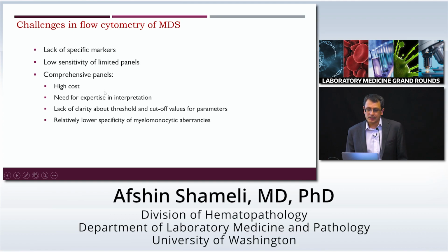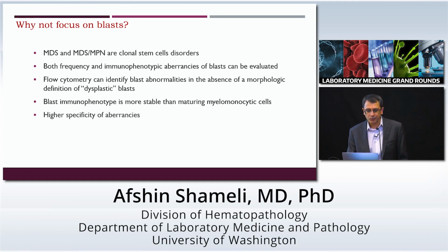Another caveat is that some of the aberrancies on myelomonocytic cells, such as expression of markers or granularity, can be affected by storage time, fixation, hemodilution, or marrow regeneration, which makes those aberrancies less specific. So the question is, why not focus on the blast population in MDS?